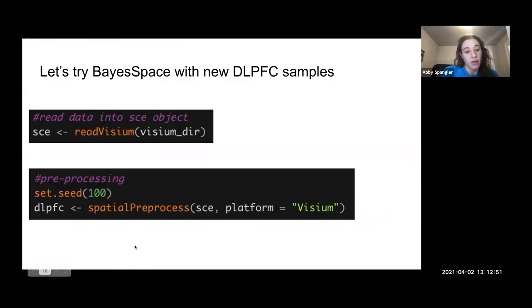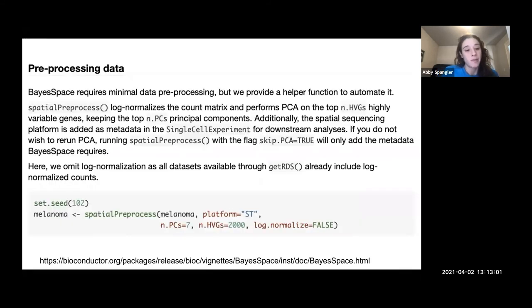And then you start with your spatial preprocessing, where, like I said before, you're going to get your highly variable genes and then do PCA. So this is from their vignette, the spatial preprocess function. Like I said, it was a different platform, but you can also choose to not log normalize the data.